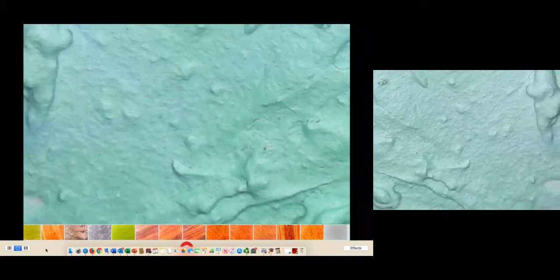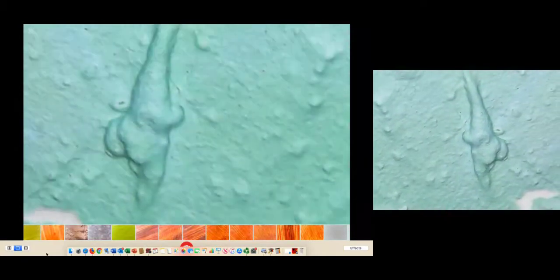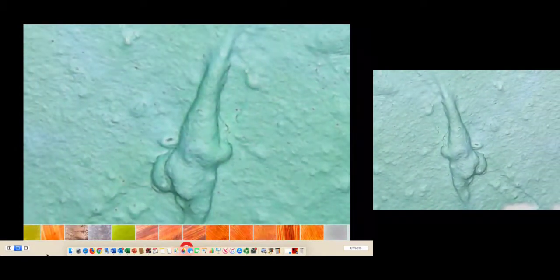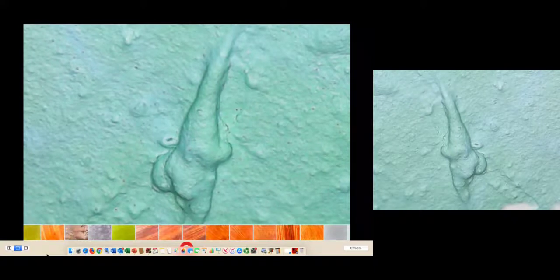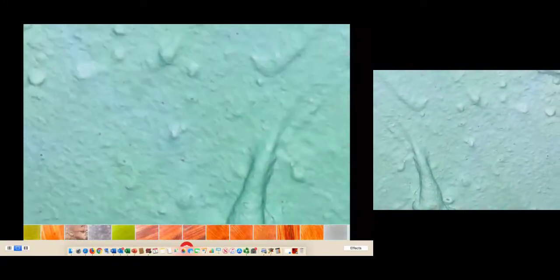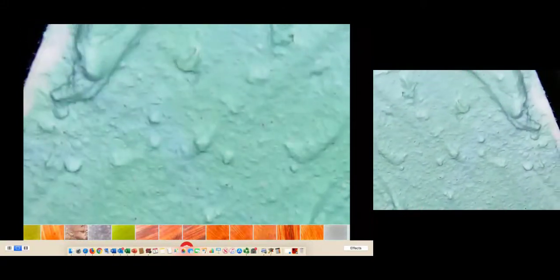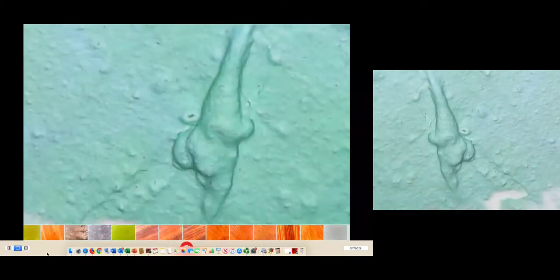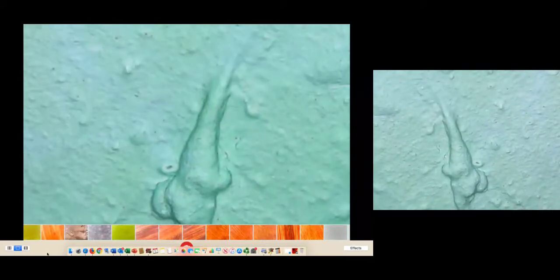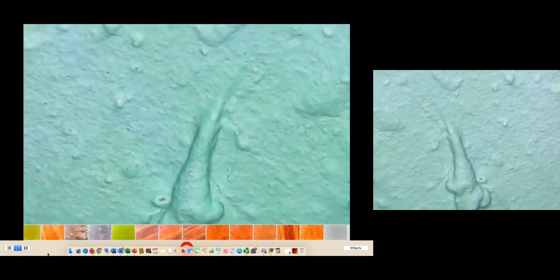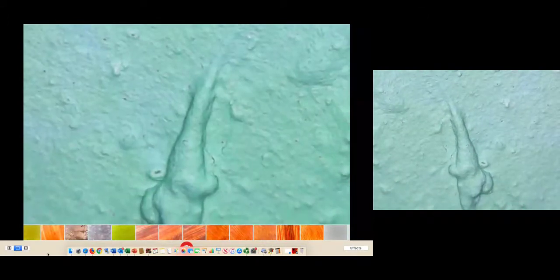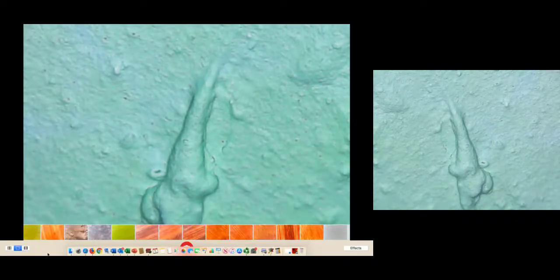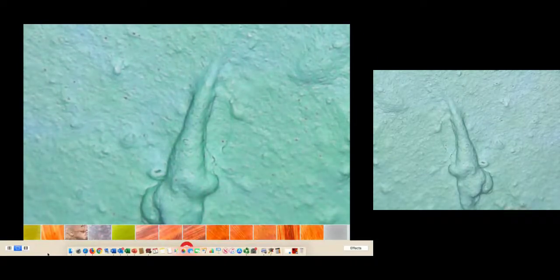So this is a lighter green color. And this was applied to the surface about 20 minutes ago. And I want to see what it will look like tomorrow, a week from now, and after testing with ultraviolet light and other physical or chemical methodologies.